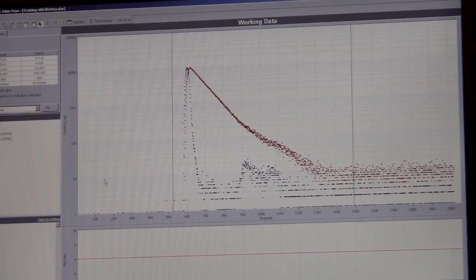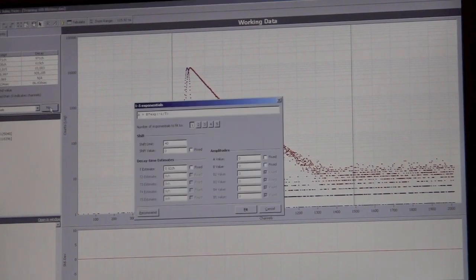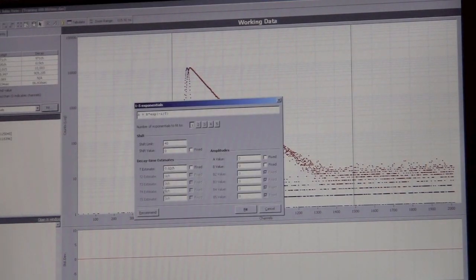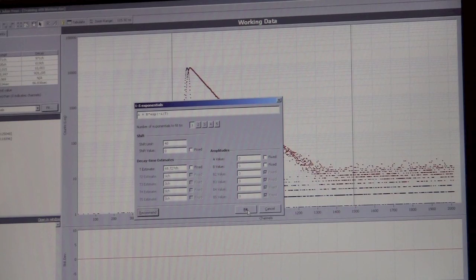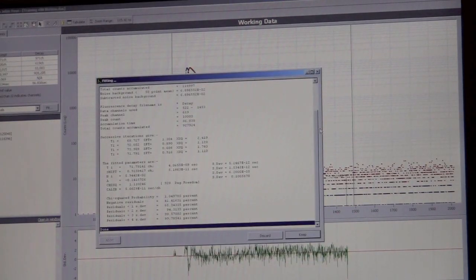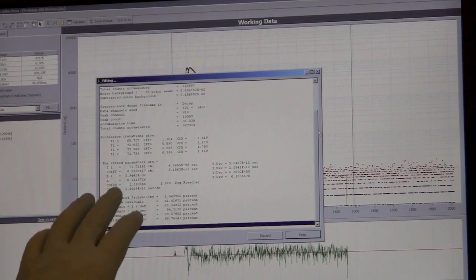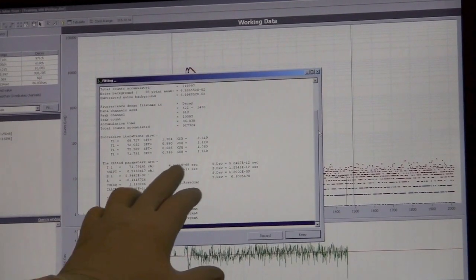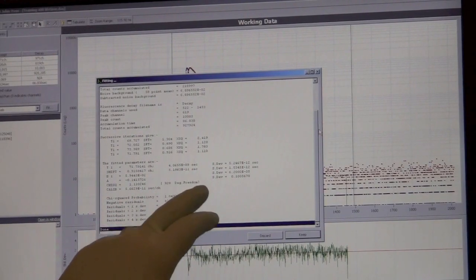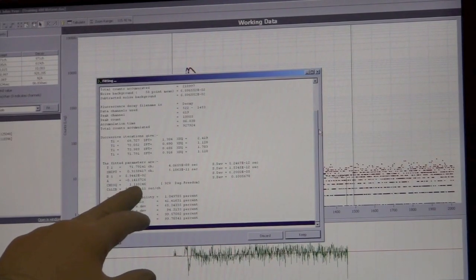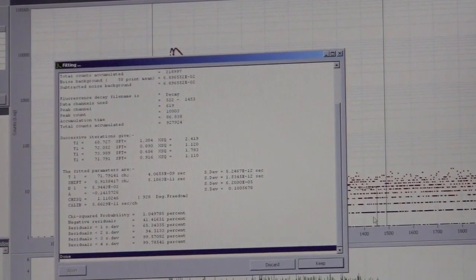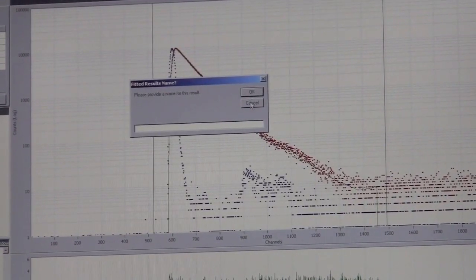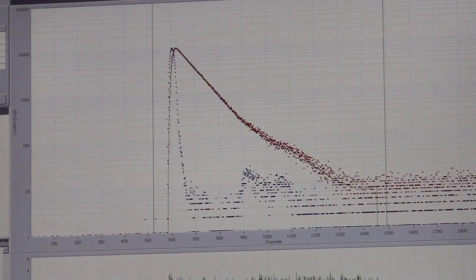Simply click on this fit function here and click one exponential. Ask the software to recommend which channel the lifetime is in, then click fit. You can see our time one is on channel 71, about 4 nanoseconds, which is right in the range for Alexa 488. Our chi-squared is 1.11, a little high. Let's see if a double exponential would fit better.